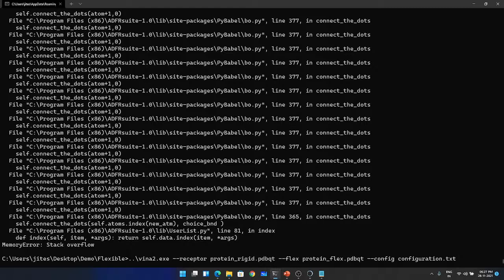Now let me go through some of the questions. Any way to show the final result score wise, just like PyRX, otherwise checking the score for each? Well, usually we do write some scripts, basic Python scripts to fetch these results and prepare the tables and all. For that, I think PyRX is the only good way if you want to do it. Otherwise, I'm going to upload this script soon on the GitHub page. I will share with all of you all these new things that I'll be adding soon.